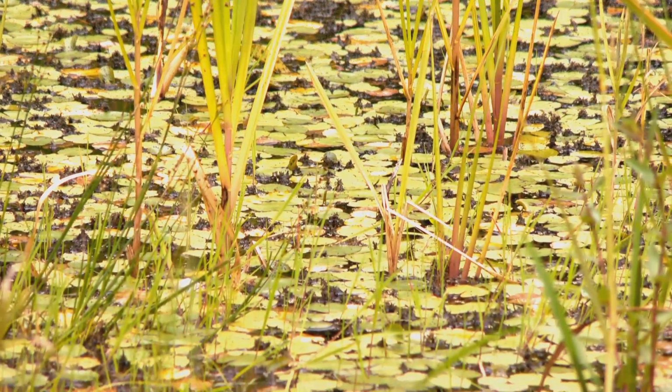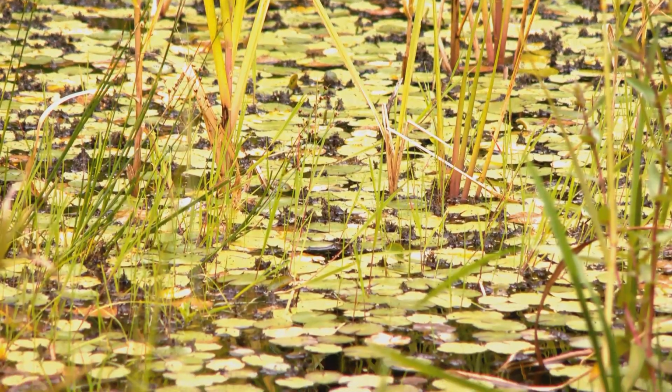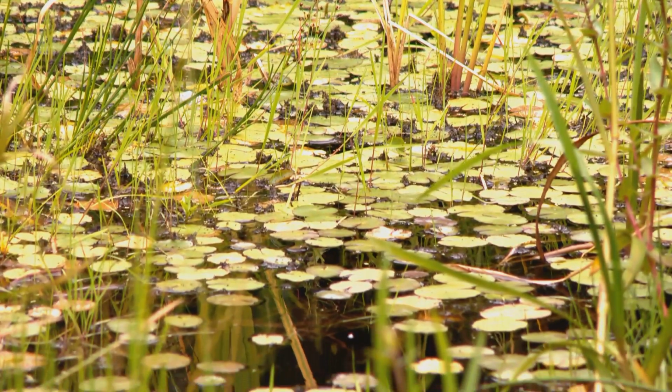Today we are going to be investigating the water clarity and pH of the pond behind me. In today's world, ponds are at threat from a variety of pollution sources, from pollution waste from agricultural and industry to just everyday waste in our lives. Pollution can lead to an increase in nutrients in the pond, leading to eutrophication.